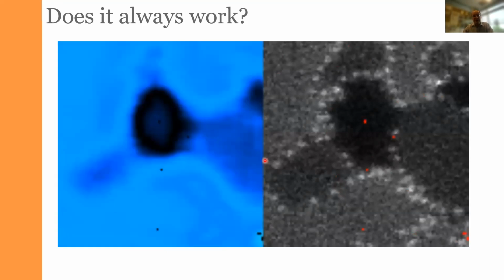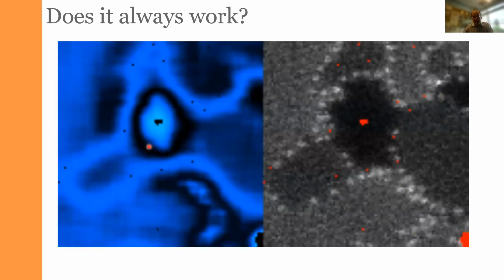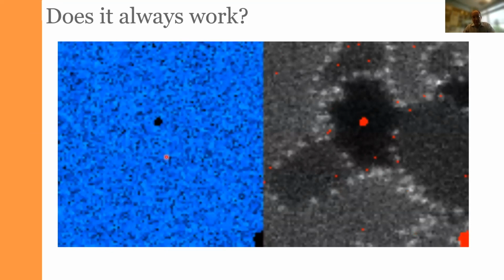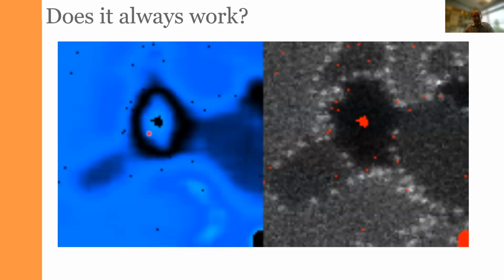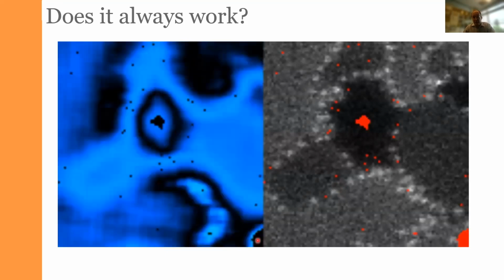So same thing here. We explored the material. We have been updating the acquisition functions, and we always do the measurement at the maximum of the acquisition function. And for whatever reason, our criterion for the acquisition function really highlights these locations. You can speculate that if we continue our experiment for some time, we'll start to do measurements here and here.